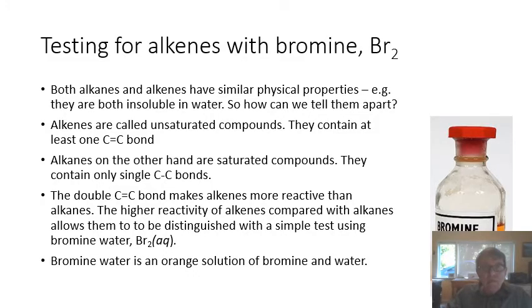It's about testing for alkenes. What we're really trying to do is to see whether an unknown solution is an alkene or an alkane. In other words, because they all look much the same, they're all colourless, has the unknown solution got a C=C double bond or hasn't it?